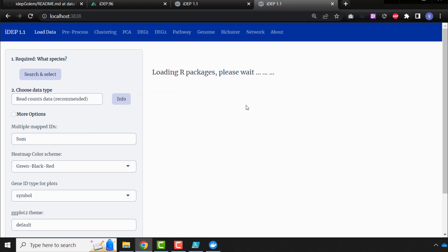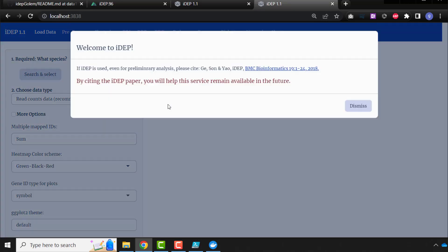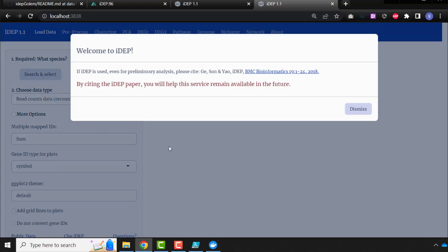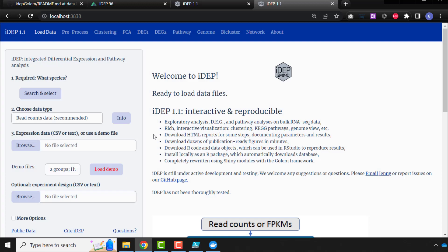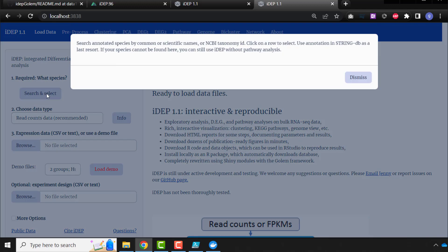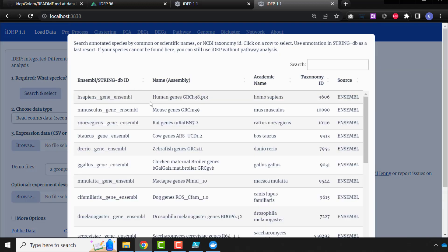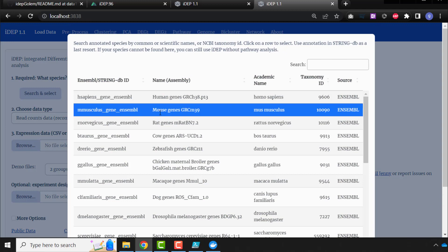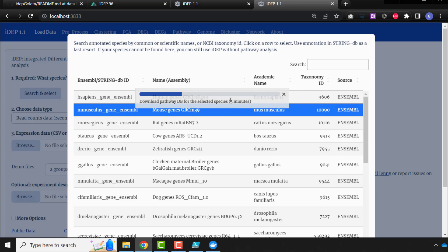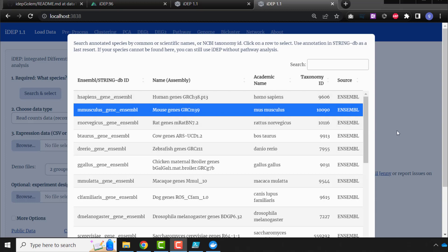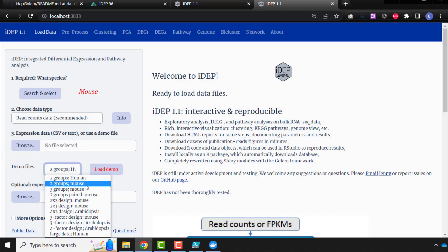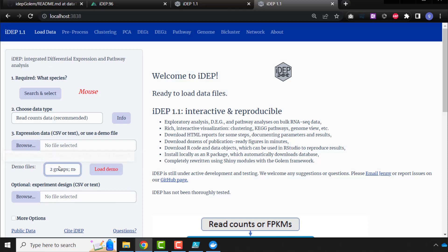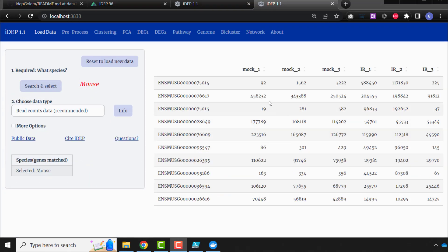And downloading the database is automatically downloaded by itself. Welcome, okay, and then you can select the species, organism. After you select an organism, the database for that organism is downloaded. This might take a few minutes. The species database is downloaded, and now you can load data, or choose the mouse data corresponding to this. It's loaded.